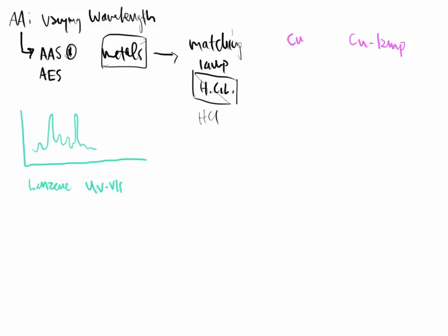And this spectrum represents that benzene has multiple wavelengths, right? So benzene can absorb light at multiple wavelengths. And we picked out a lambda max, which is where we get the highest absorbance read. So let's pretend for a minute that that is my highest absorbance read. That's my lambda max. That's the one that I go to read because that's the most sensitive one.